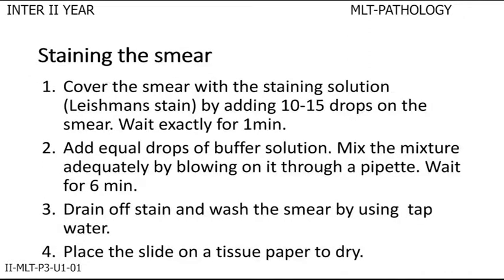Staining the smear: cover the smear with staining solution. We use Leishman stain by adding 10 to 15 drops on the smear. Wait exactly for 1 minute, and then add equal drops of buffer solution. Mix the mixture adequately by blowing on it through a pipette. Wait for 6 minutes. Drain off the extra stain and wash the smear using tap water. Place the slide on tissue paper to dry.